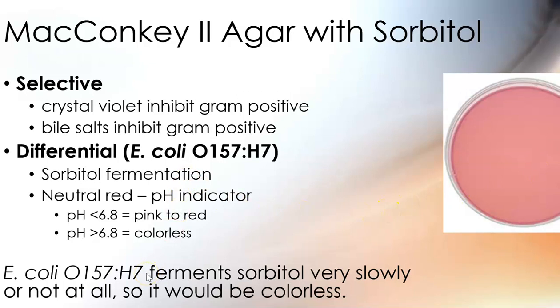So again, you're still looking for is it pink or not? Because it's still the neutral red, it's just a different recipe. Sorbitol is a sugar alcohol.